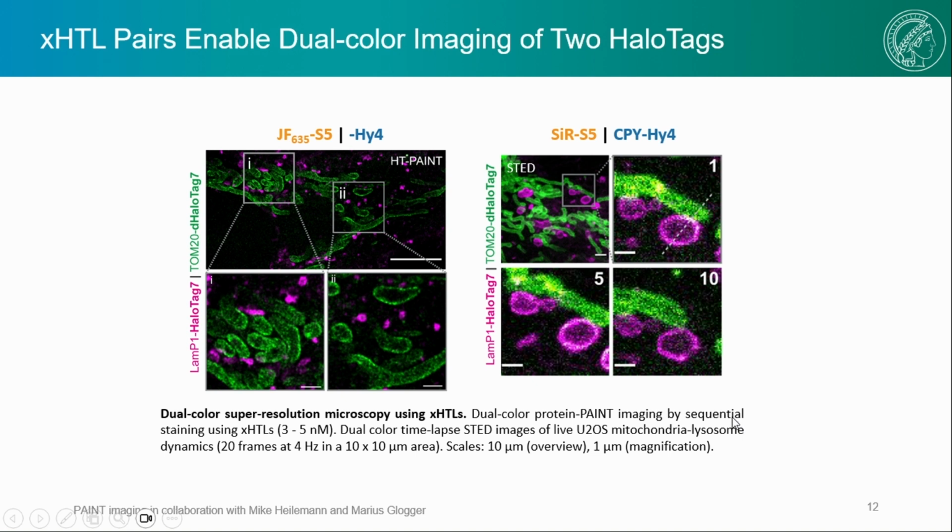And this is also compatible with live cell STED imaging, using both probes simultaneously and depleting them with the same depletion laser. And this allowed us also to track the dynamic interactions of mitochondria and lysosomes over a couple of high-resolution frames.